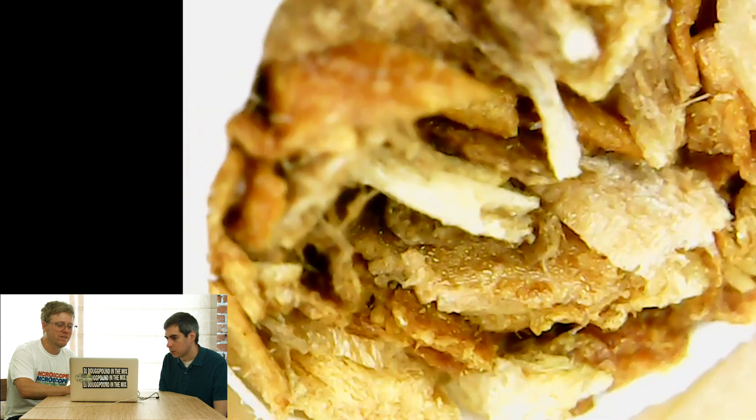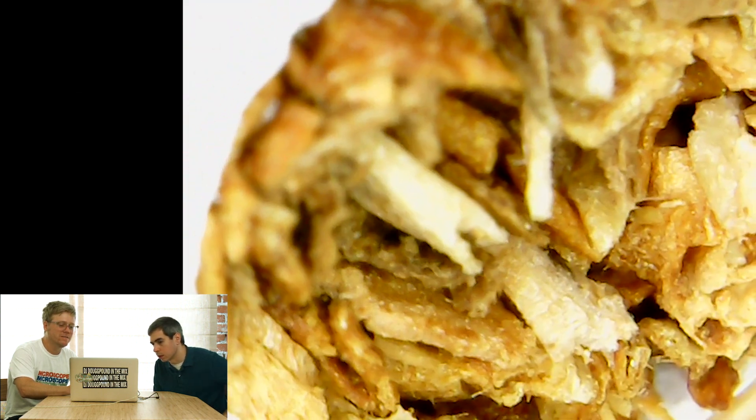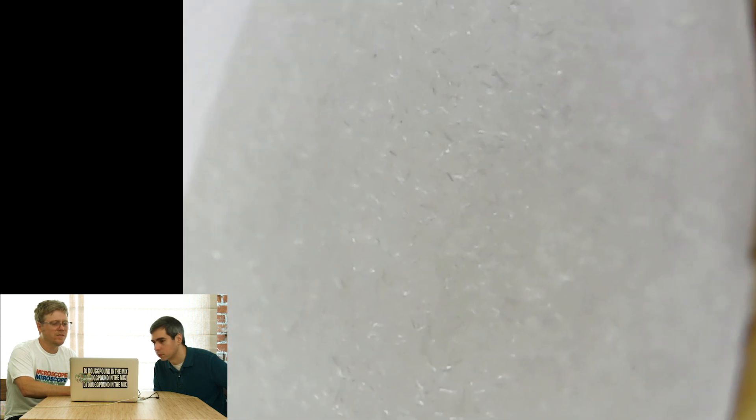Look at that — that's the tip of the cigarette, what it looks like before it's lit. Let's look at the filter part. Is this a healthier cigarette? An organic cigarette or something? I doubt it. Look at that — the edge is so pure white, and the fibers are so small.